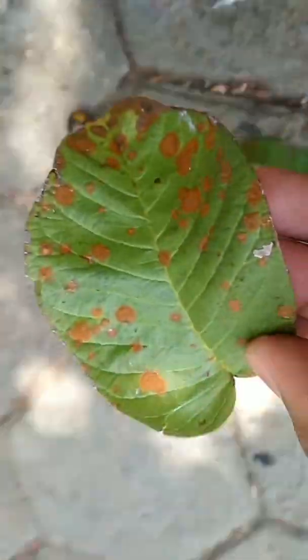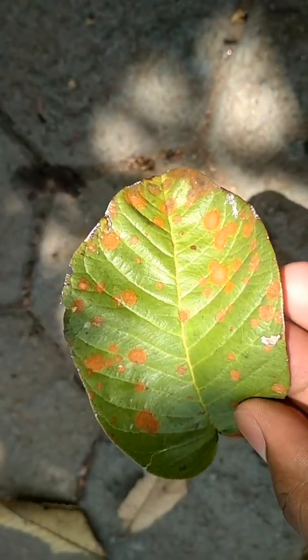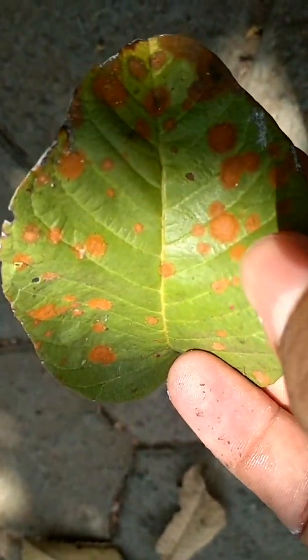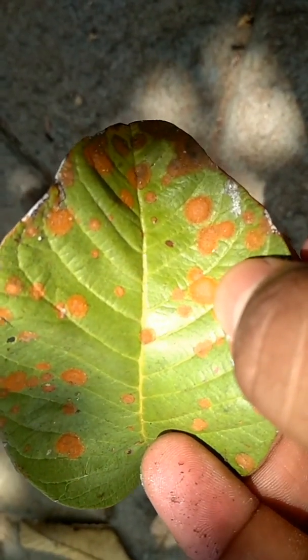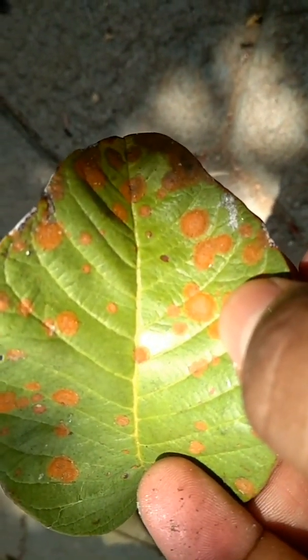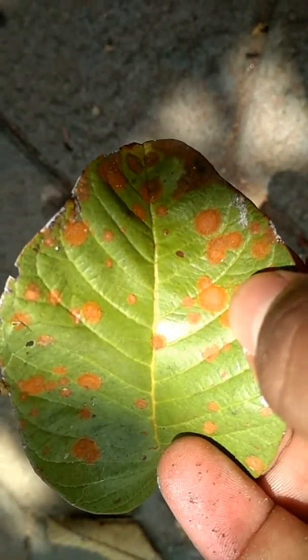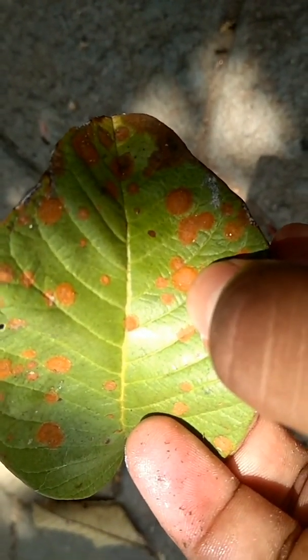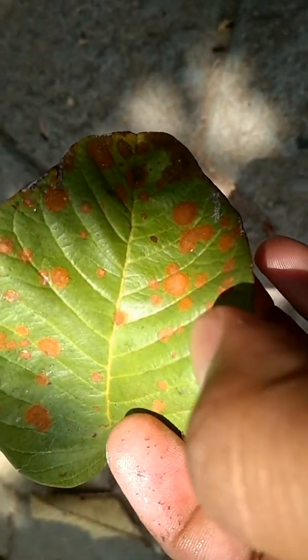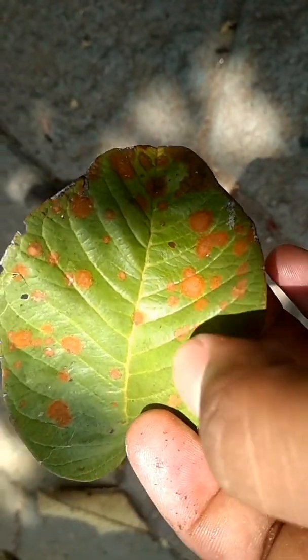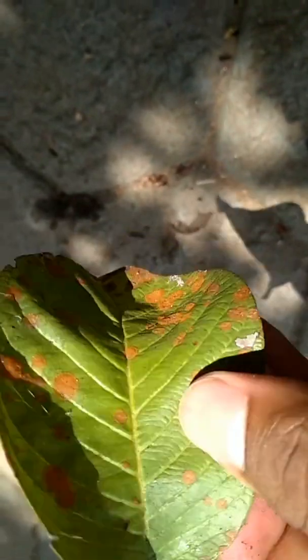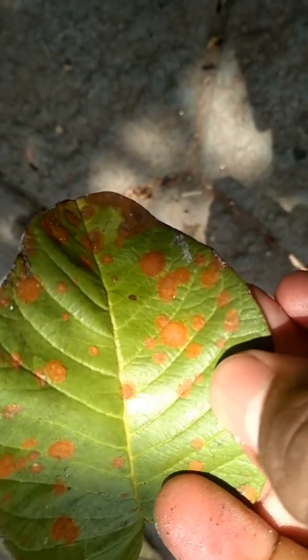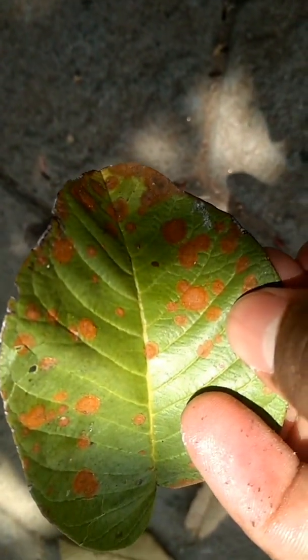In severe stage, this red color algal rust produces pale green color patches on the center. The center will produce pale green color patches. Why? Because alga is chlorophyllous. It will produce chlorophyll, so in later stage it will produce pale green color rusty appearance.